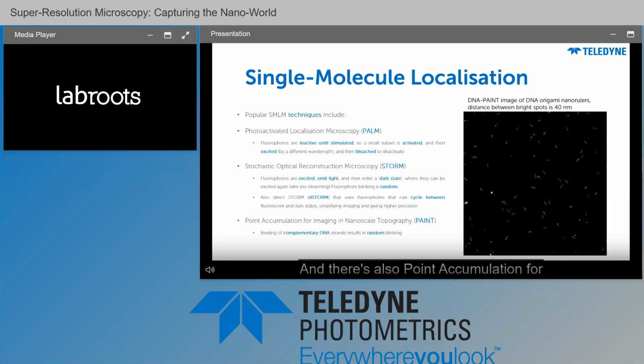And there's also point accumulation for imaging in nanoscale topography, or PAINT. This is where binding of complementary DNA strands results in the random blinking. You can see here an image on the right taken with DNA-PAINT. The distance between the bright spots of these origami nanorulers is 40 nanometers, so the resolution is extremely high.